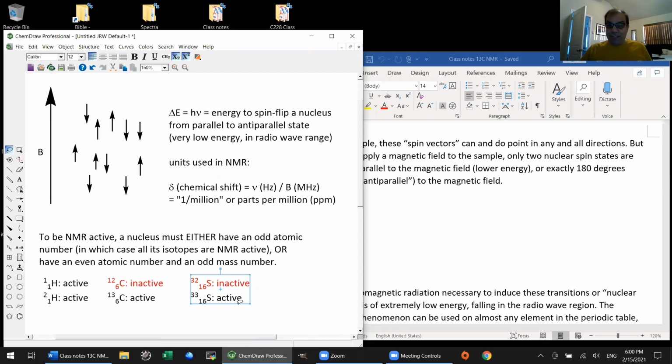All I got was a peak with a peak width comparable to the entire field width. It was just a broad, shapeless peak that did me absolutely no good whatsoever. Oh well, you win some and you lose some.